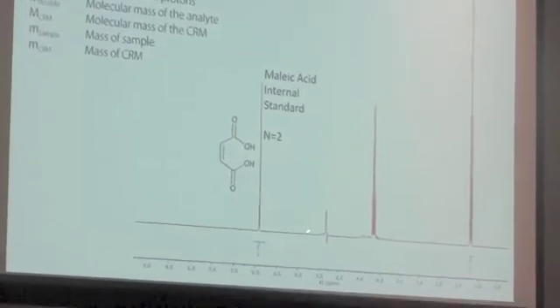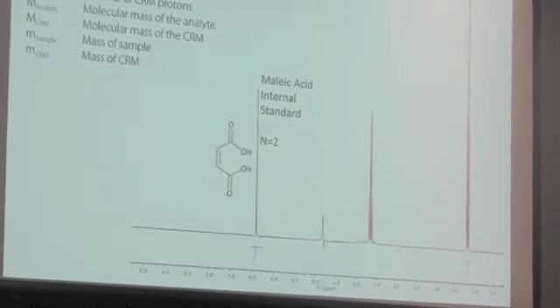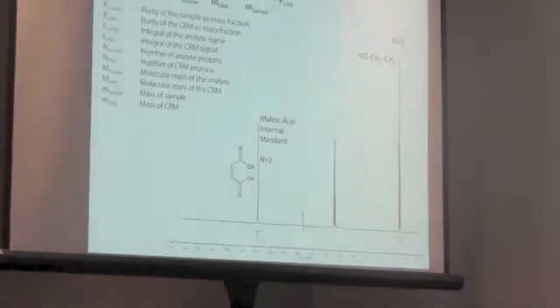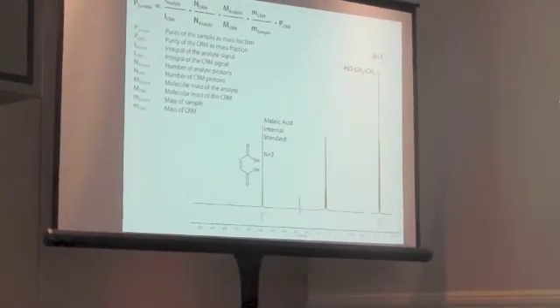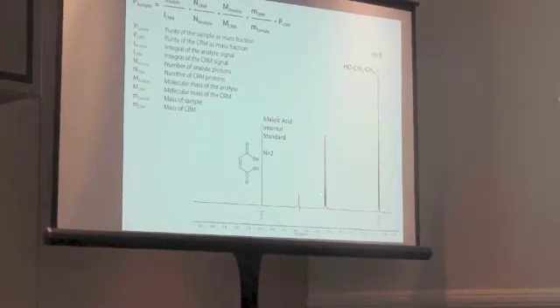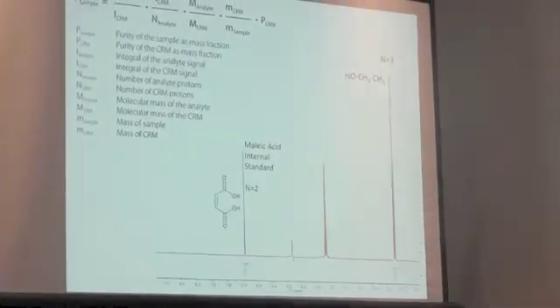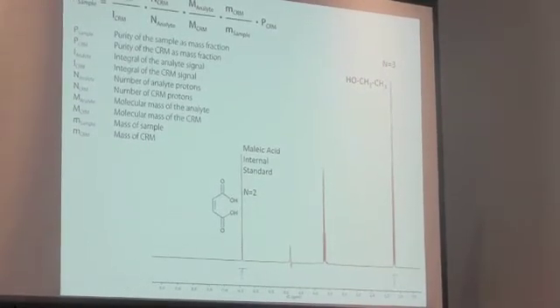And then you redissolve that sample in D2O, which is heavy water, which is what the heroes of Telemark blew up in Norway. It's like, you know, making heavy water for making the atomic bomb. That stuff is like $1 for a milliliter now. It's dirt cheap, and they make it by distillation, I think. And so you put the sample back into D2O. Deuterium doesn't show up when you're looking at the hydrogens, but it's exactly the same chemistry as water, so it doesn't do anything weird to the sample.